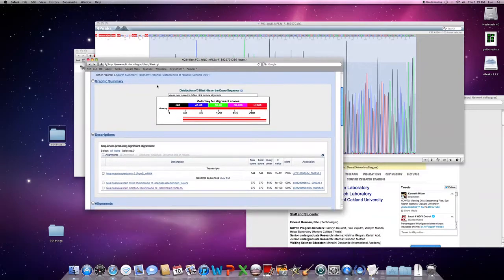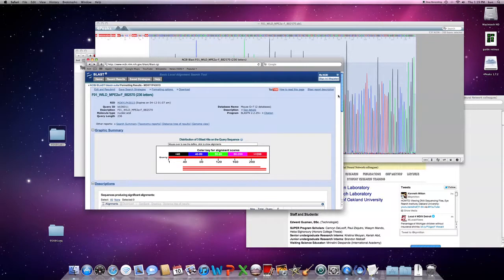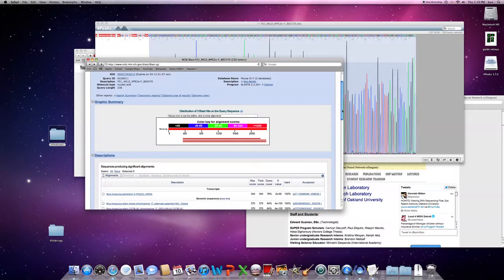Sometimes it takes a few minutes, so I've already run one. And now you're back with your web browser. You're basically here at the NCBI site, and it has done a blast of the sequence to do a logical alignment.